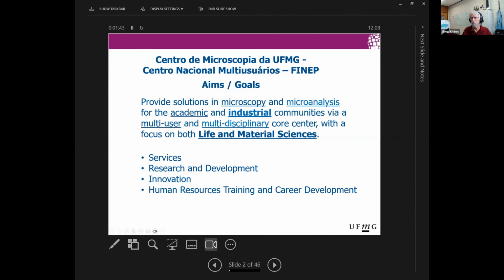I want to tell you how it's been a huge advantage for us to have this connection with industry. Multi-user, multidisciplinary, a big core center, I'll describe that. We focus on both life and material sciences. We provide services, we help people with research and development, we have our own innovation, and we do lots and lots of human resource training and career development.